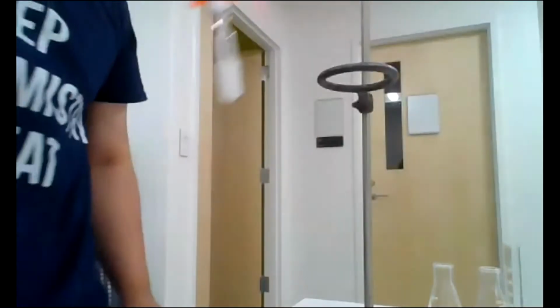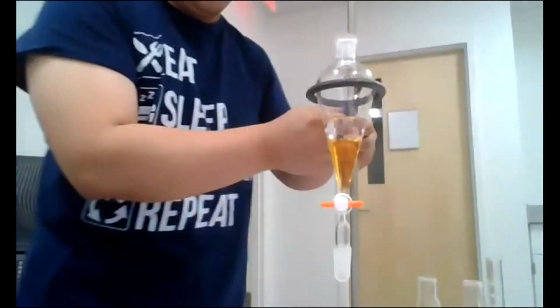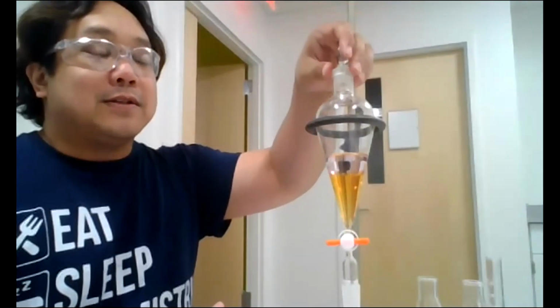Now, when the separatory funnel is resting in the clamp or the ring stand, you want to keep this unstoppered, because you don't know whether the two solutions are going to produce gas. If it produces gas and there's a stopper right here, sometimes the glass-to-glass joint gets stuck. And if you're producing a lot of gas, you're going to build up a lot of pressure.